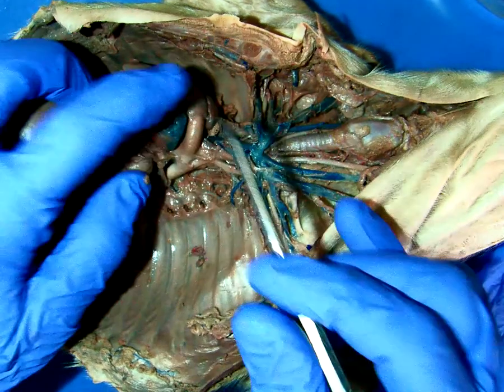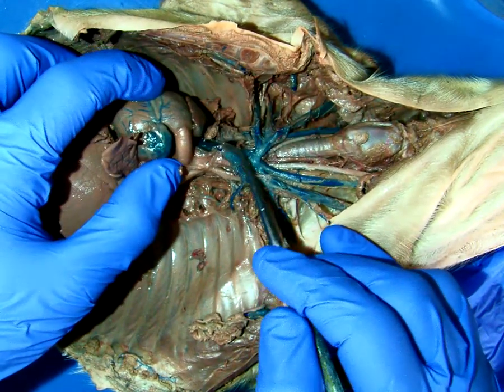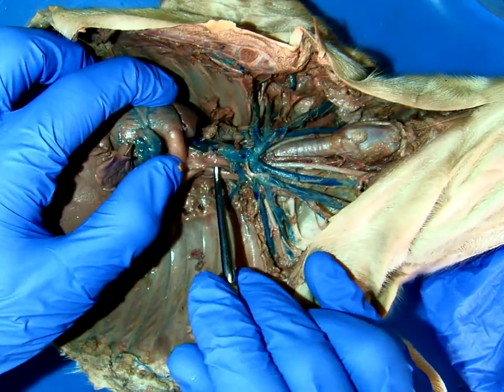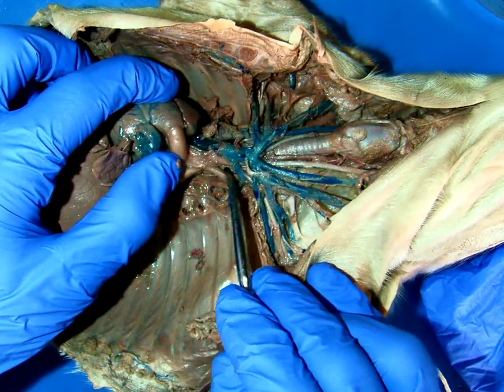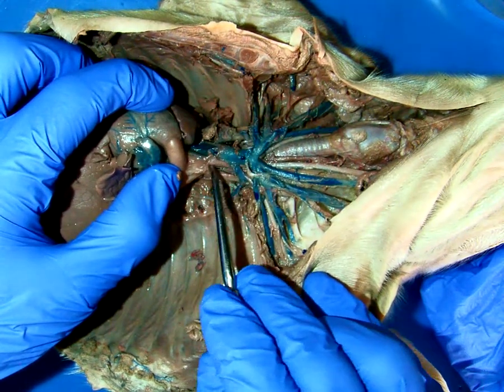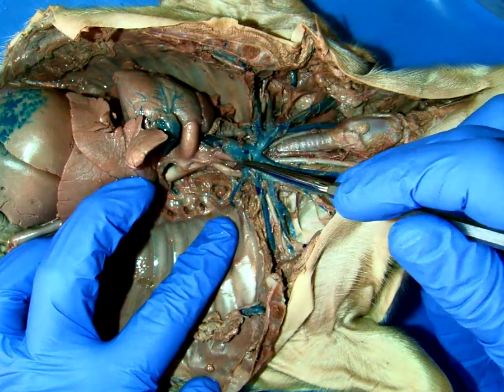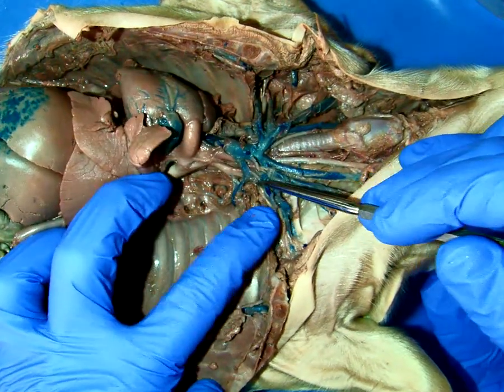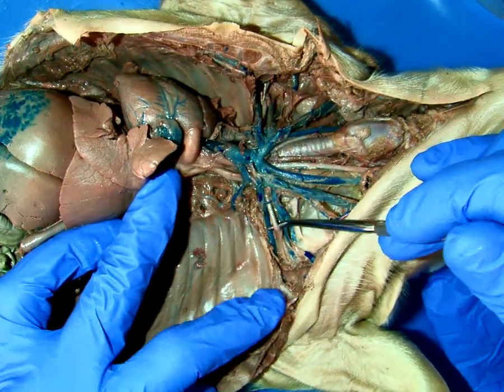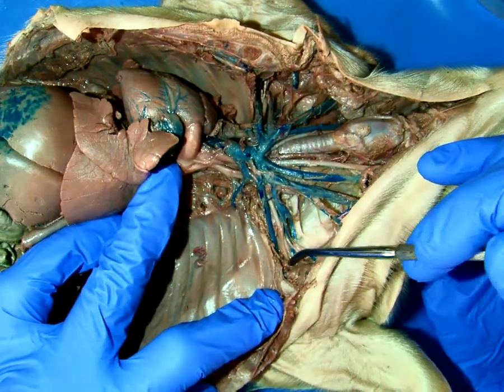the rib cage. So from this aorta, which we see here, there are only two branches in the quadrupeds. There's a brachiocephalic branch right here, the first branch, and the second branch is the left subclavian. So there's not an additional left carotid branch. That's actually going to come off of the brachiocephalic artery. All right, so we move up here, tracing that left subclavian, and it appears to be this vessel going into the arm. So this is still part of the left subclavian, moving into that upper limb, or forelimb of the pig.